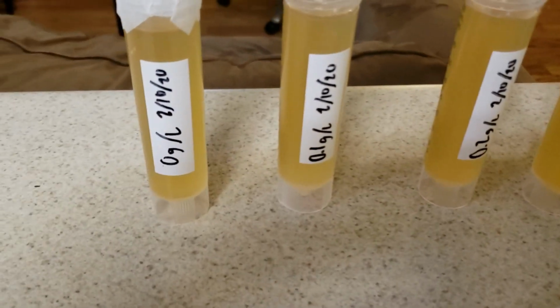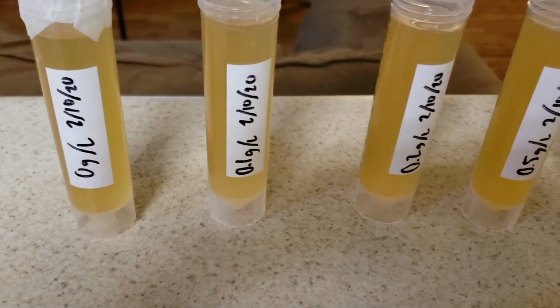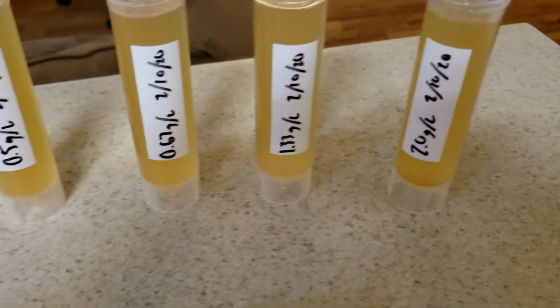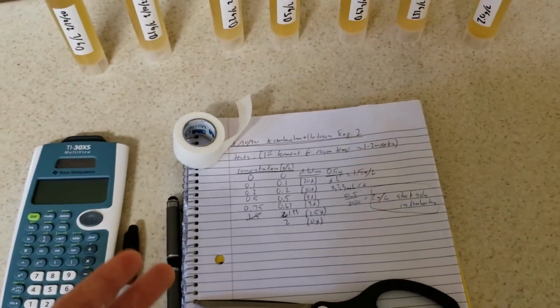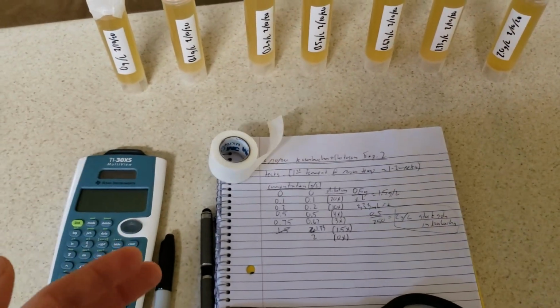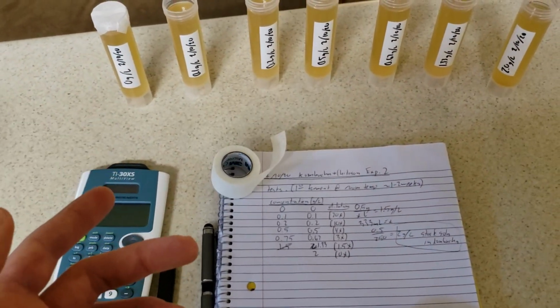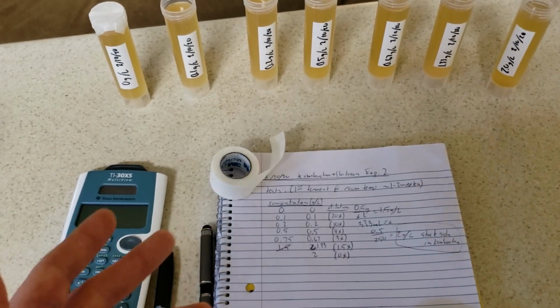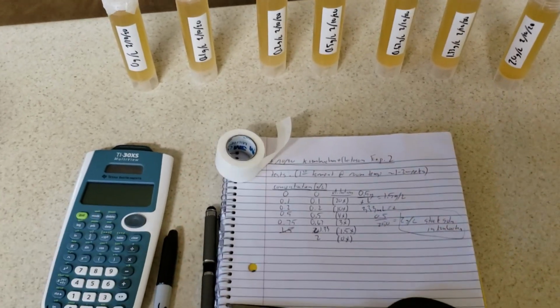So you can see I did different concentrations of chitosan, so 0 grams per liter, 0.1, and so on, up to 2 grams per liter. And this information is based on a previous experiment that I did. Because I kept good notes on the previous experiment and because I labeled my previous experiment, I was able to narrow down the range of concentrations for chitosan to potentially reduce alcohol content.